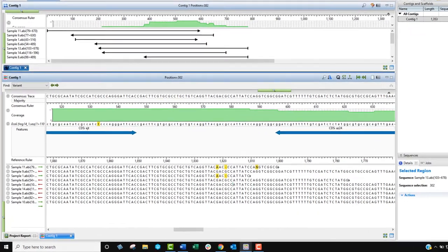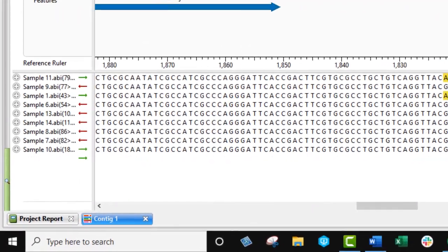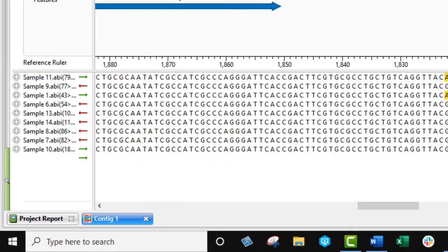To view trace data in the alignment view, right click on any read sequence and make a choice from the menu.